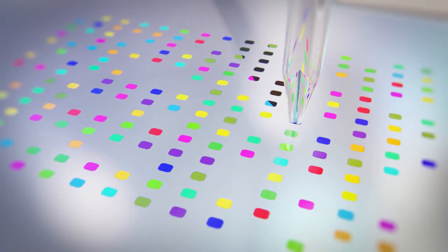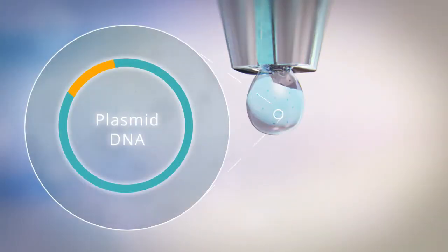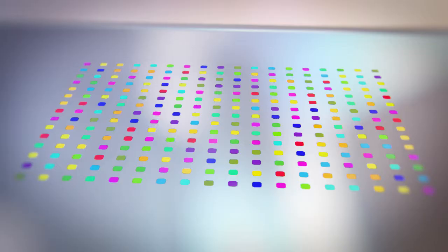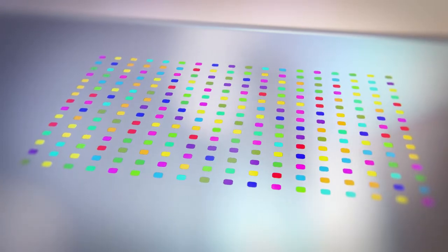The first step in the production of this device is printing an array of spots containing DNA that codes for specific receptors and a calcium sensor. DNA for the different receptors is repeatedly deposited in a random pattern onto a glass slide.